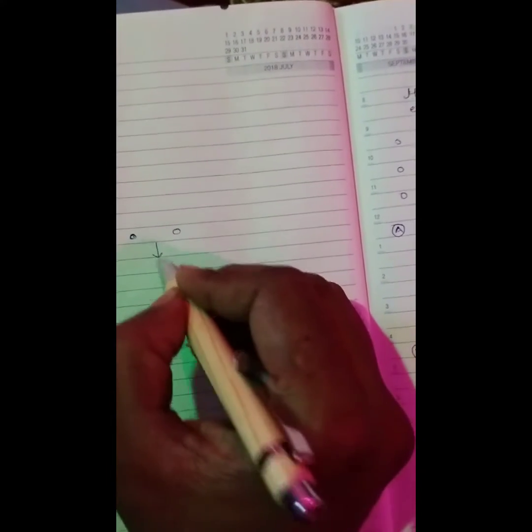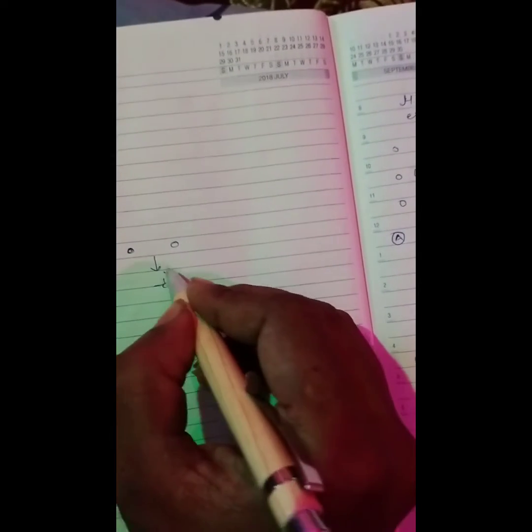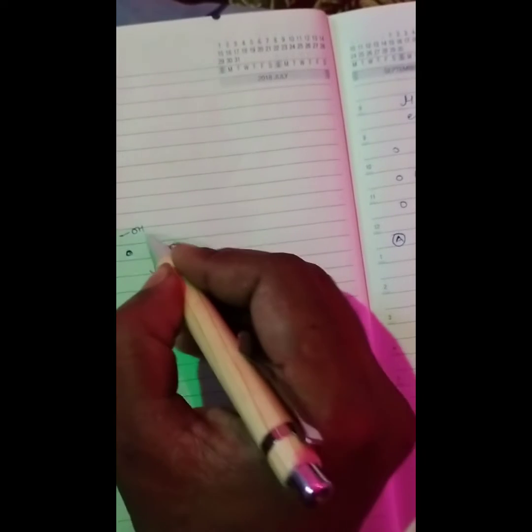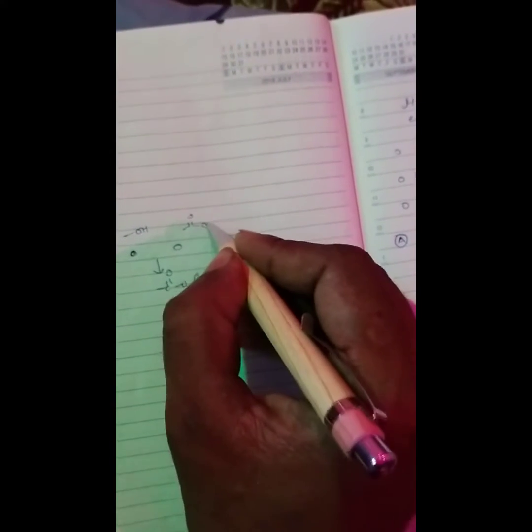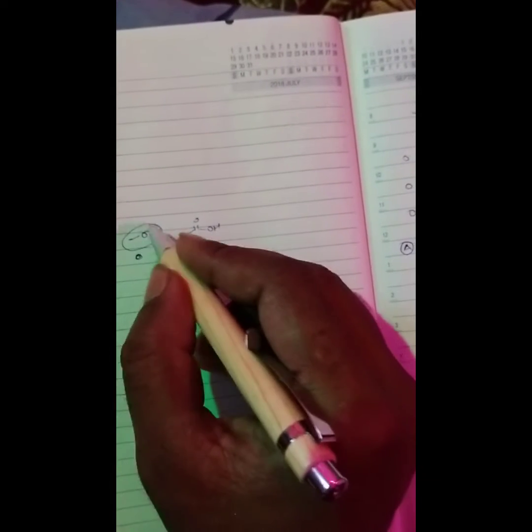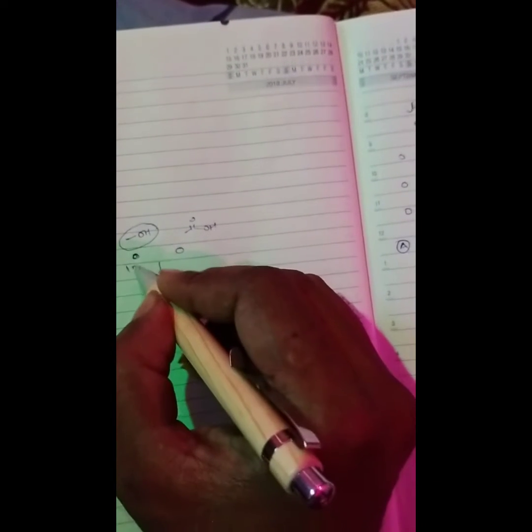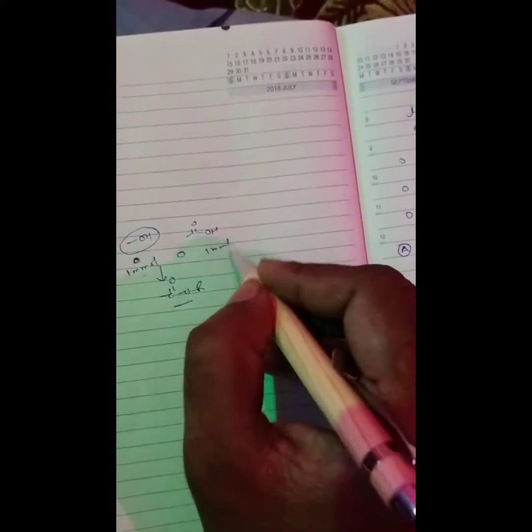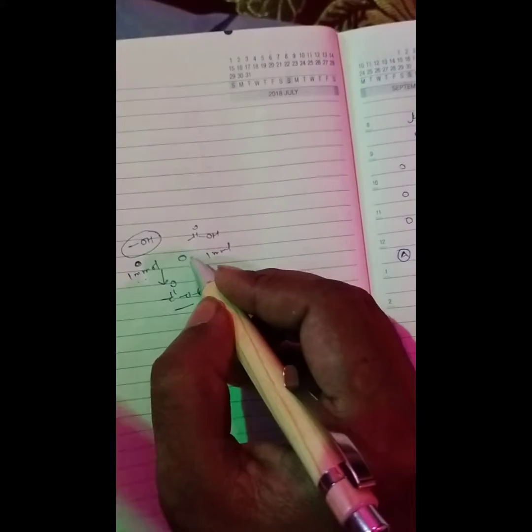Suppose you are going to synthesize an ester, OCOR. The starting materials will be the OH compound and the COOH compound. First of all you should know the NMR of these compounds, because the reaction occurs in a 1 millimole to 1 millimole ratio, or you can take 1 mole. So this ratio will be taken.